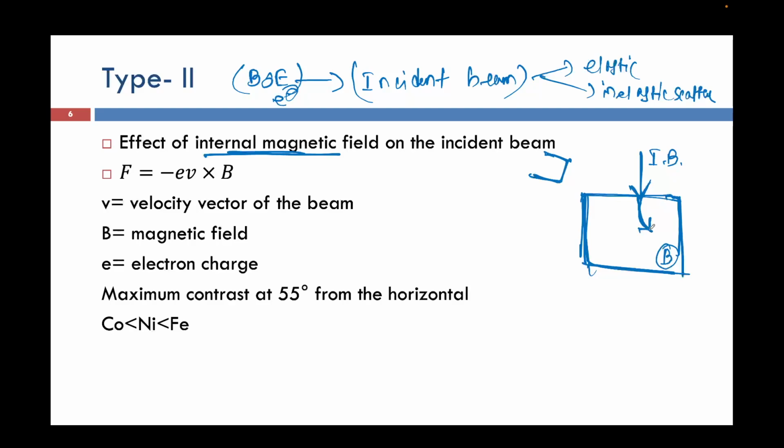Eventually, due to the energy of this backscattered electron beam, the incident beam will come out as a backscattered electron beam, but the penetration depth will be a little bit more if the magnetic field inside my material is allowing them to penetrate deep into the material. Then in that case my backscattering electron yield, eta, will decrease, and I will get a darker region, right?